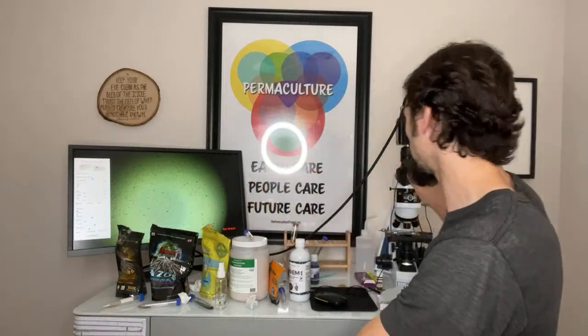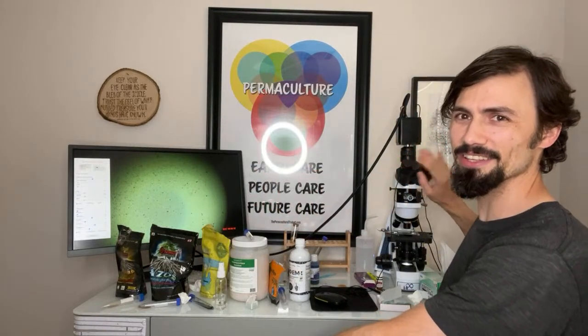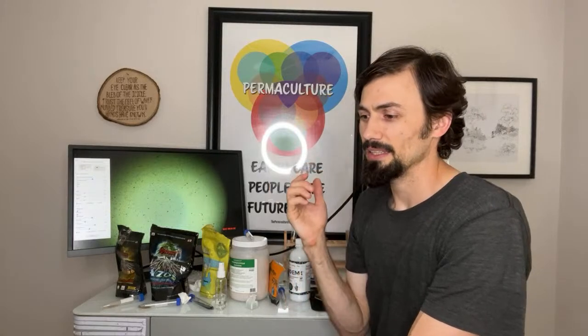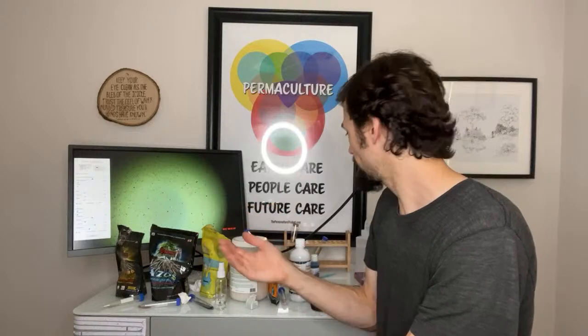It's also easy on the eyes. A lot of people get headaches from eyepieces. I don't even have eyepieces here. And it also, I mean, this is the way to actually share. So let's begin.